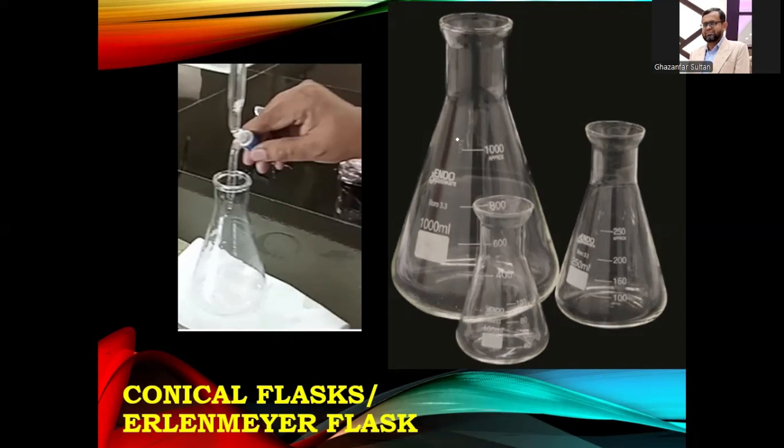Okay. So conical flasks are of different volumes, either 250 ml, 100 ml, or even smaller ones of 10 or 5 ml as well. But usually we use the conical flask of 250 ml in our laboratories for titration.